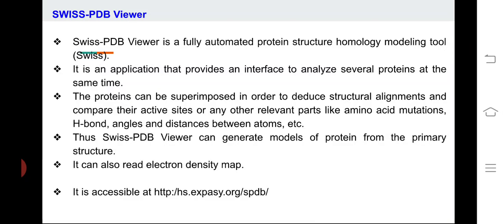Also, at the same time, electron density maps can be read by this Swiss PDB viewer, and these can be viewed using this extension. Thank you.